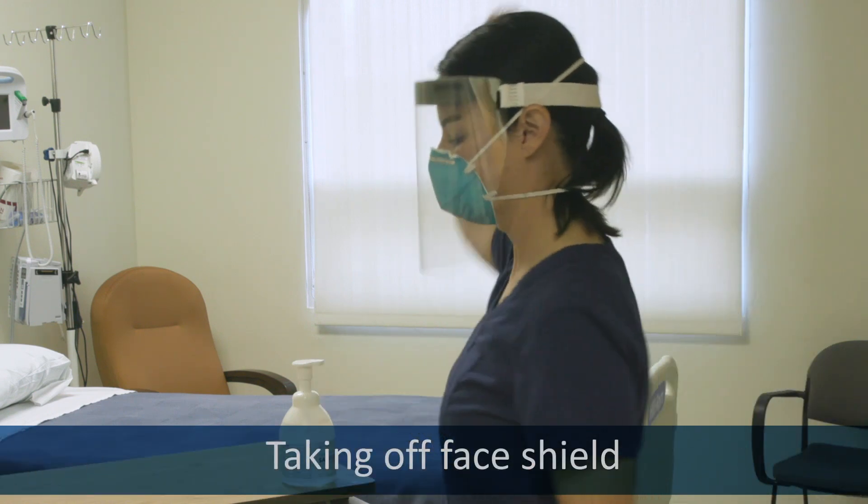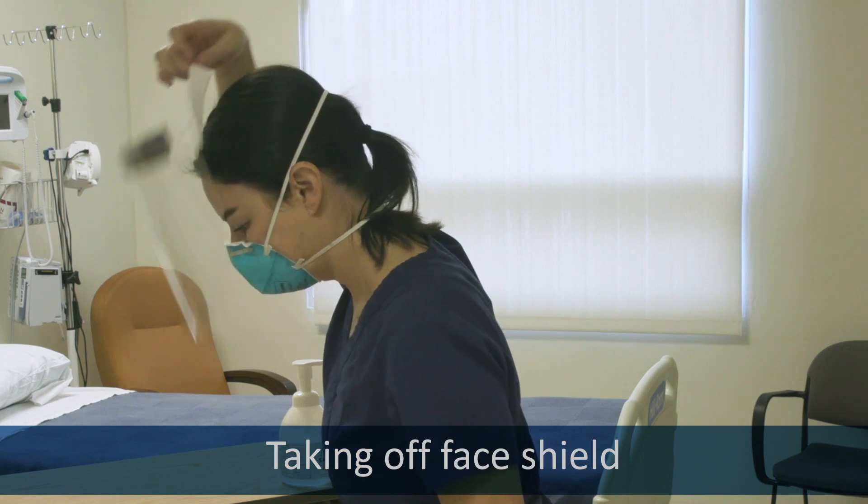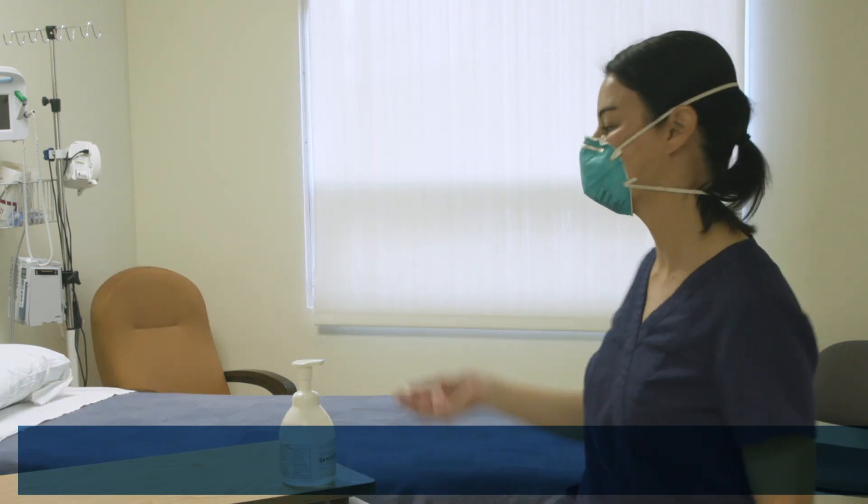Remove the face shield by the strap, up and over your head without touching your skin, or remove your goggles.